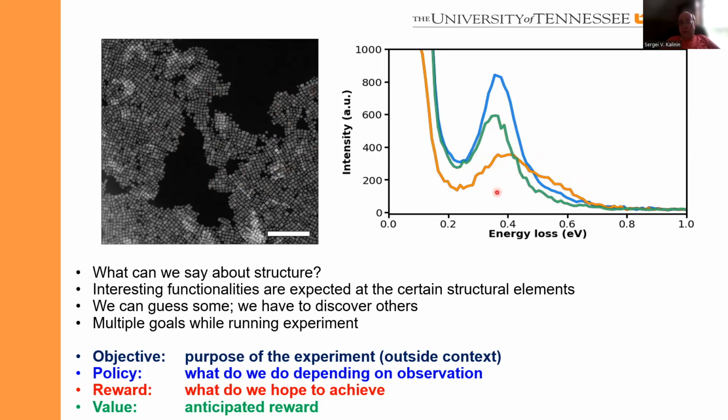So a human cannot do that. We can only study the grid, perform the grid measurements, and then analyze the results. So obviously, these are the experimental measurements that are possible in the context of running the microscope without knowing much outside of that.